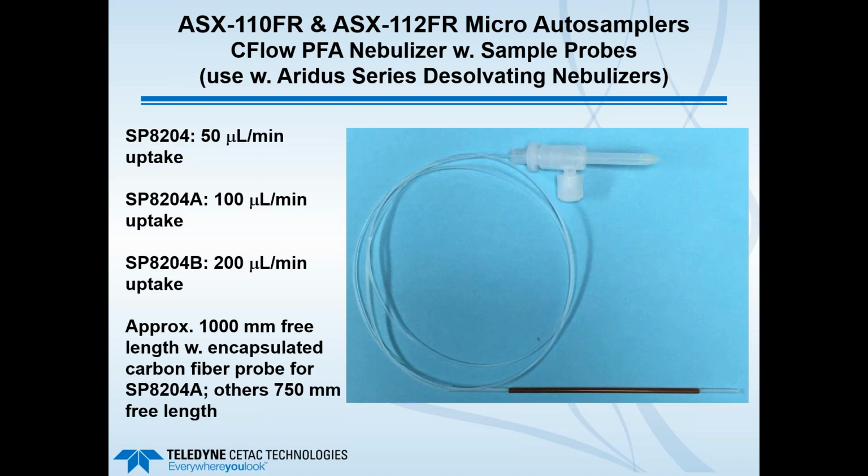These would attach, of course, just like the probes before on the previous slide, except this is all one piece, and the nebulizer would then insert into the nebulizer inlet port of an Aridus II nebulizer system that would then connect to your host ICP-MS.